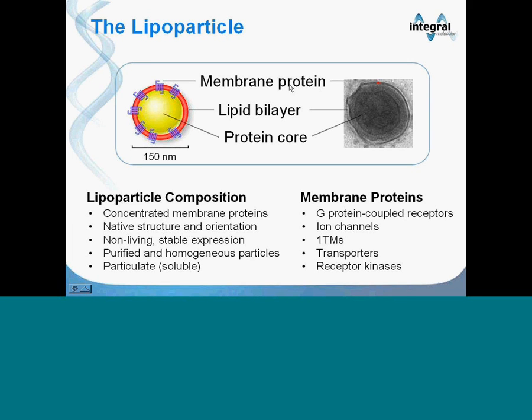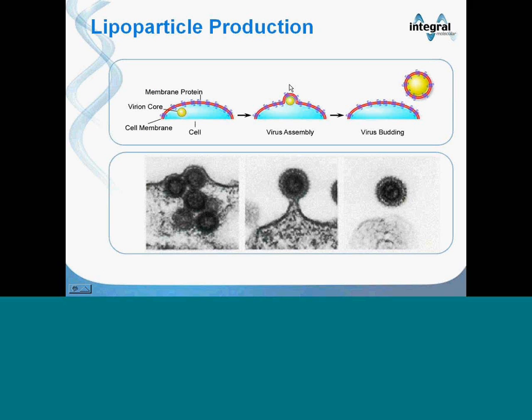Lipoparticles are purified from the culture supernatant and resuspended in buffer. A solution of lipoparticles will have an opaque appearance because the particles are particulate, but they can be treated as soluble proteins. 1 microliter of lipoparticle can contain as many specific membrane proteins as 10,000 cells expressing 1 million receptors each.